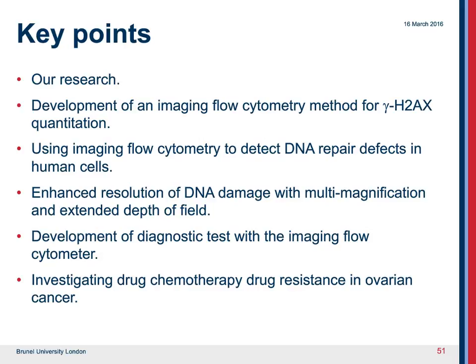Most recently, we've been able to acquire a new generation imaging flow cytometer, where we've been able to develop more enhanced and better protocols with the multimagnification capability and something called extended depth of field, which I'll come to a bit later. This is all leading towards developing a diagnostic test for the determination of chemotherapeutic and radiotherapeutic responses in cancer patients. And finally, for the last few slides, I'll talk a little bit about how we're investigating chemotherapy drug resistance in ovarian cancer.